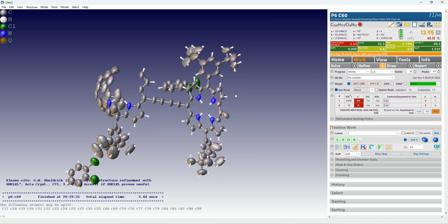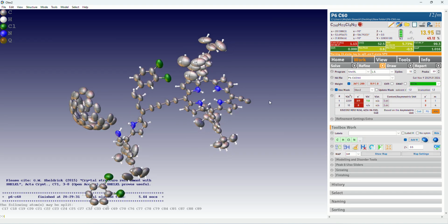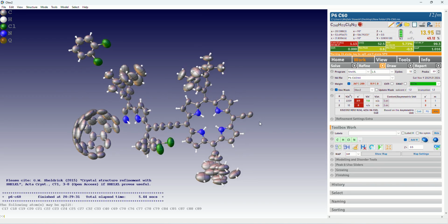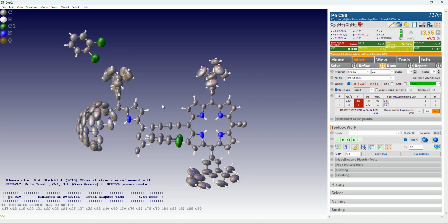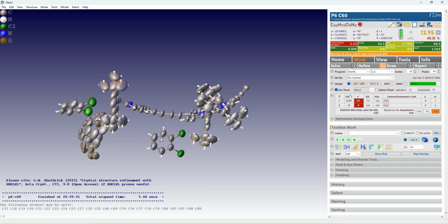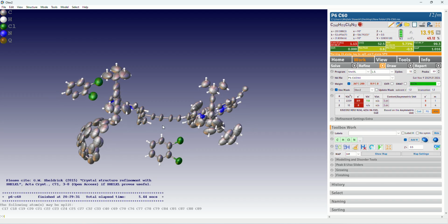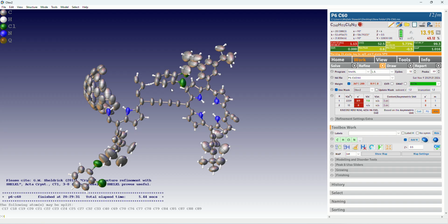And if our purpose is to show a general connectivity, geometry of the molecule, packing, without any discussion of bond lengths or angles, then it's totally fine to have a structure like that. But if you now say in your paper that your carbon-carbon bond is 1.32, then I would say this is not a very publishable structure, because with such bad data quality, you can't really discuss bond lengths. It's essentially meaningless. It also had to be heavily restrained. So again, the structure has to be fit for purpose.